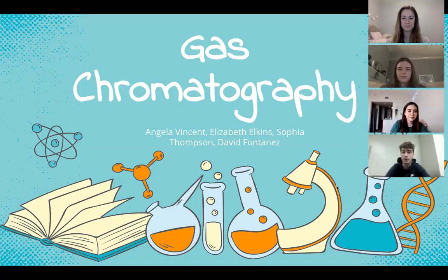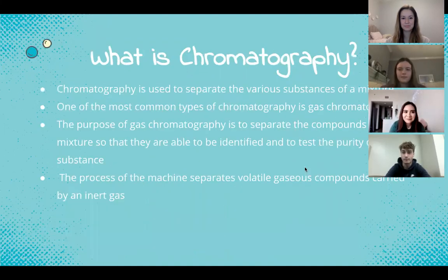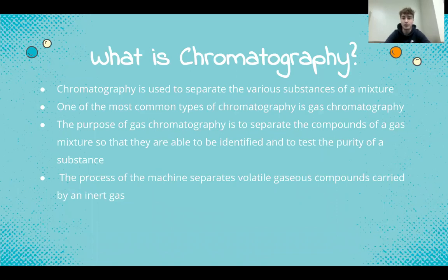Hey guys, today we're going to be talking about gas chromatography. So what is chromatography? Chromatography is used to separate the various substances of a mixture. One of the most common of these types of chromatography is gas chromatography.